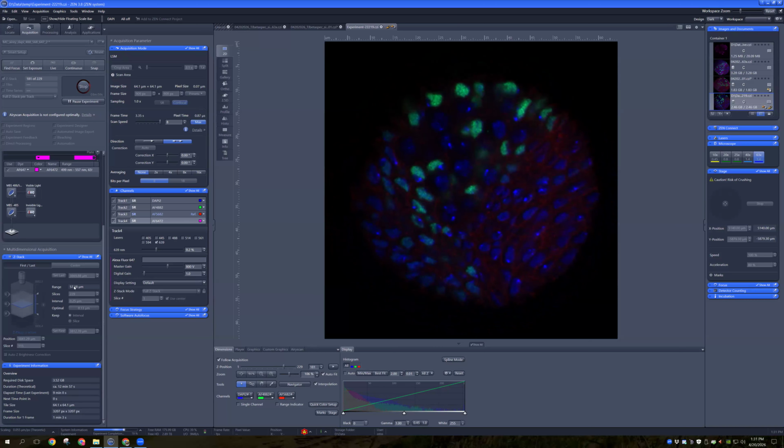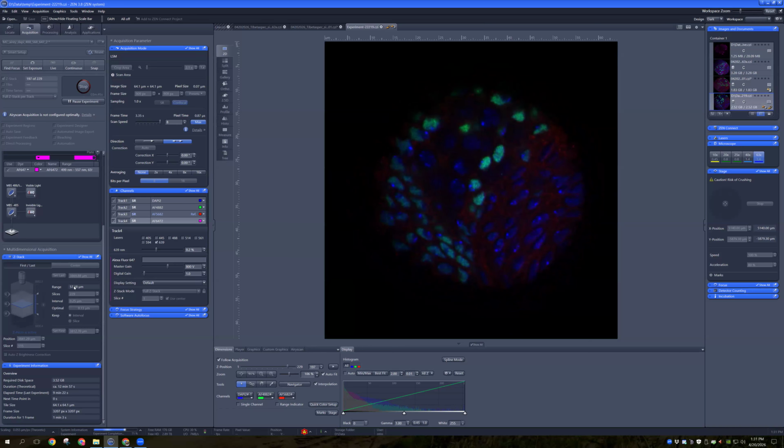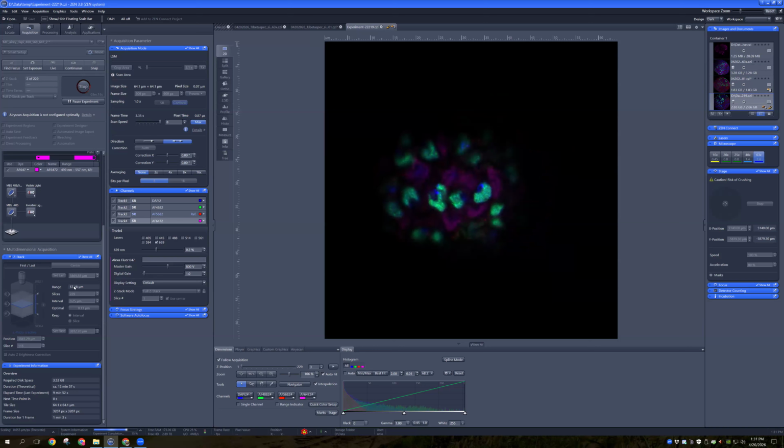Hi, I'm Ria. I'm an undergraduate student from Ashoka in India. I am currently doing a thesis where I'm working on the Drosophila ovary model itself. I'm looking at the impact of dietary modulation on ovarian stem cell behavior in Drosophila, which is why I thought this would be interesting to join. More than a comment, I'm just amazed by how you're doing larval dissections, because with ovary dissections in general I keep losing my mind. I'm also very new to this, I've been doing this for almost a year now. How did you practice that?